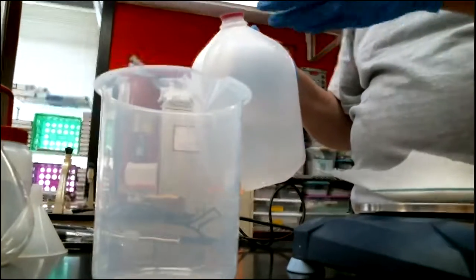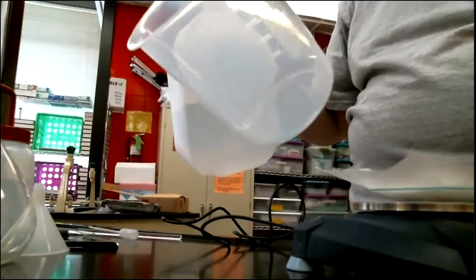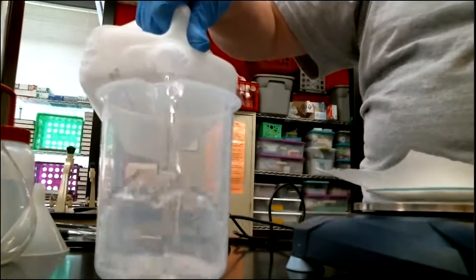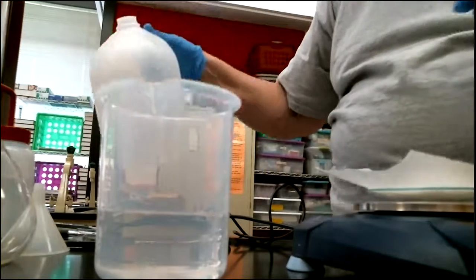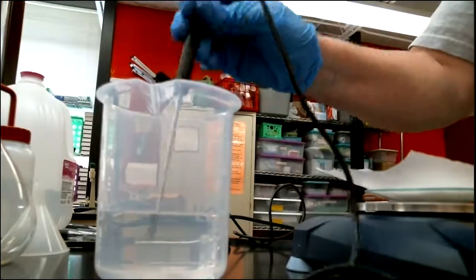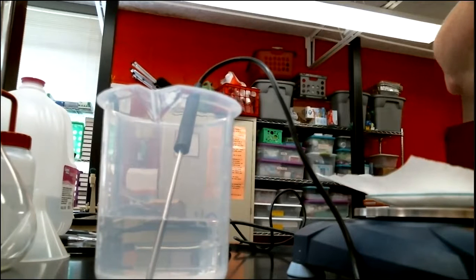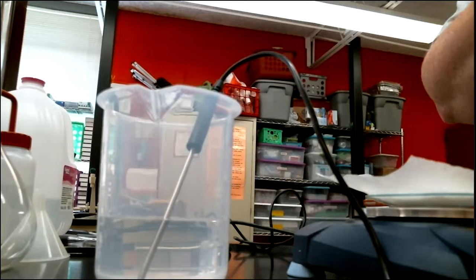Now I've got to be careful because my flask only holds 500 milliliters. This is a 500 milliliter beaker. So I do not want to fill up the beaker because I'll have too much water for my flask. So I'm going to do maybe halfway. Now, doing this also lets me show you something about temperature. So I'm going to stick my little temperature probe in here and get the temperature of the water. And then I'm going to show you what happens when we add the salt. It's very interesting.